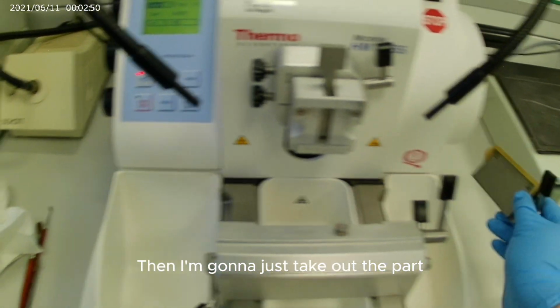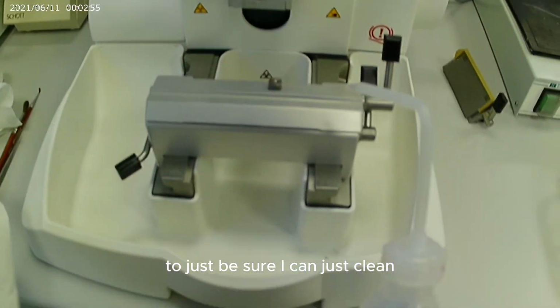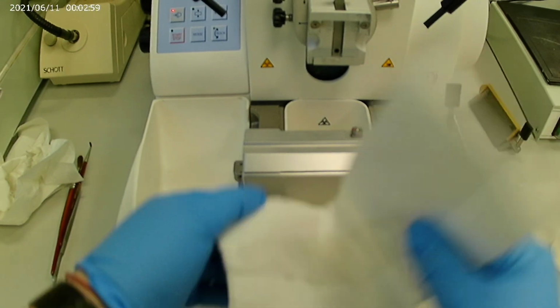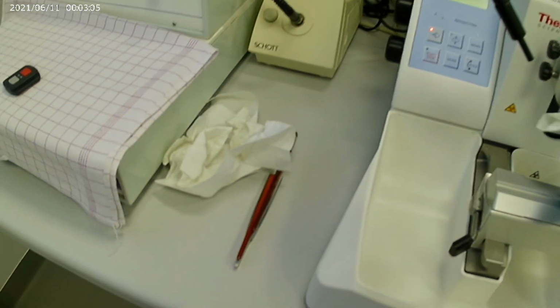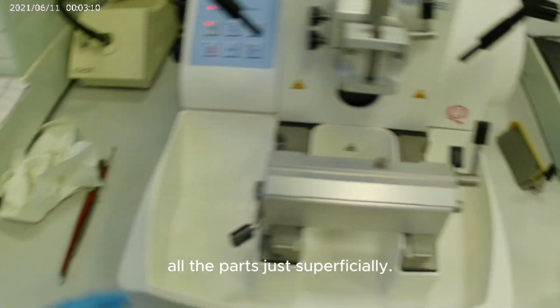Then I'm going to take out the part that contains the blade, to be sure I can clean in a safe way. And I'm going to clean with 70% ethanol all the parts, just superficially.